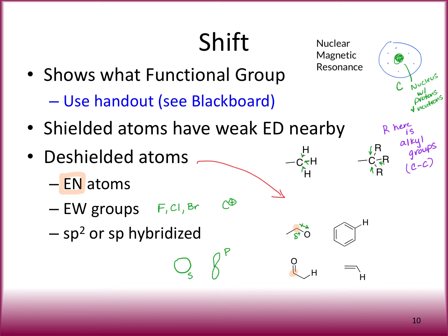All right, electron withdrawing groups. So things that are next to something that's withdrawing. So either they're next to a positive, they're next to a partial positive, or they are next to a halogen or something, okay? So the only one I see is actually this one here because it's next to a double bond O, which actually has a partial positive. So that's an electron withdrawing group, okay?